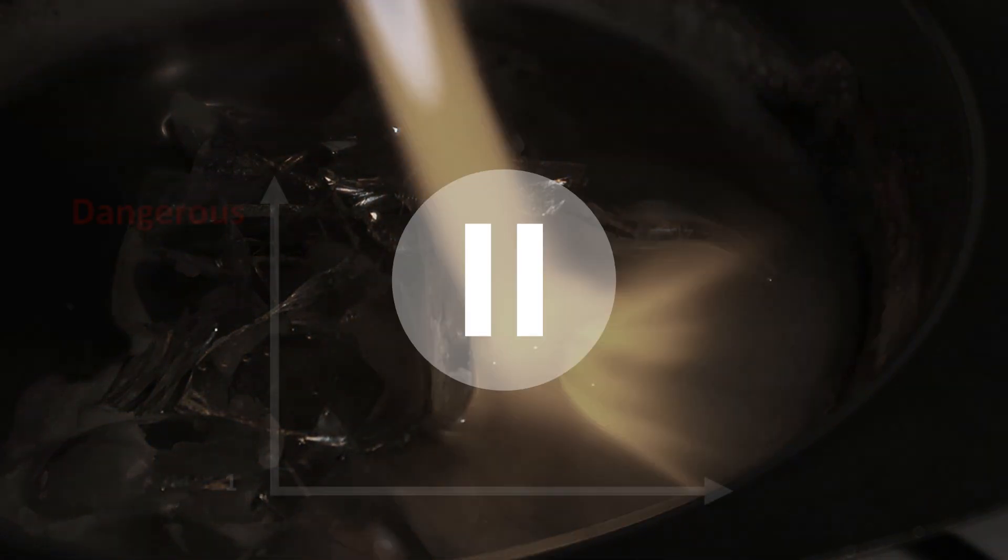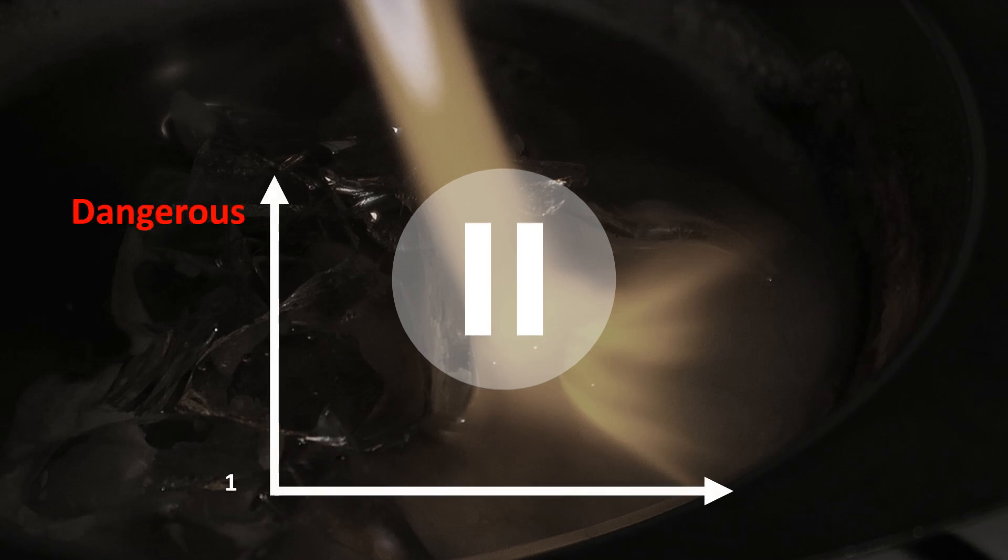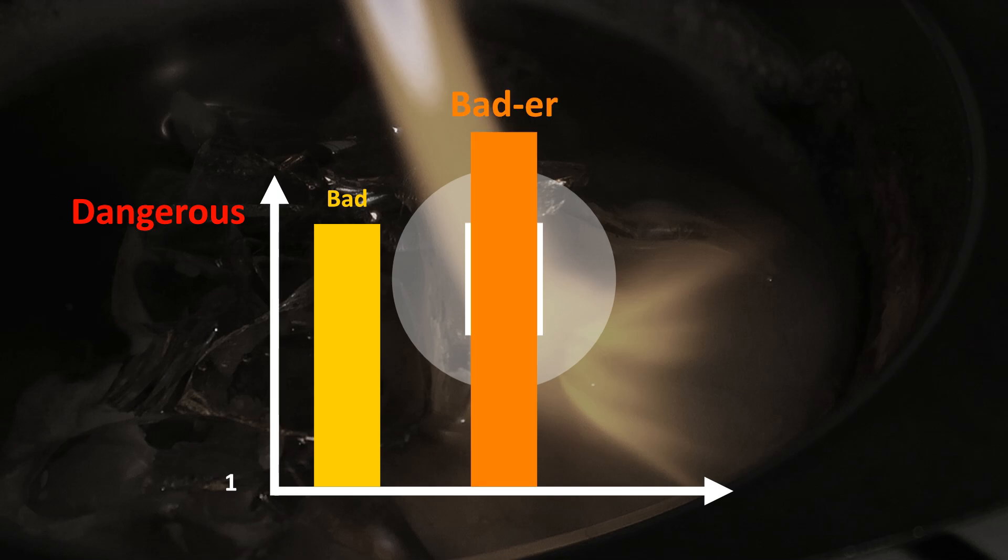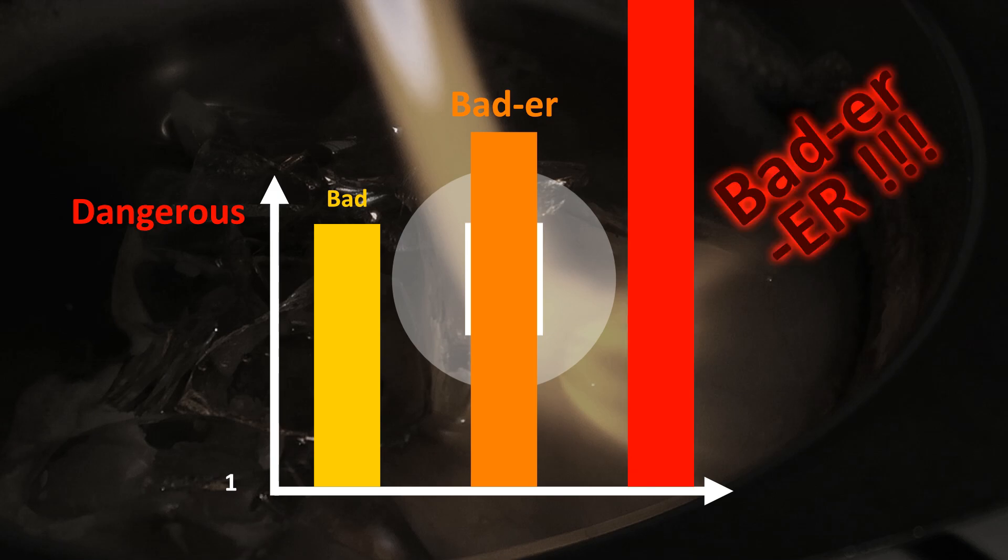A quick word of caution here. On a scale from 1 to dangerous, concentrated sodium hydroxide solutions are usually bad, but here we're dealing with the solid stuff, which is badder, and when it's melted at plus 300 degrees, it's badder-er. Let me demonstrate.